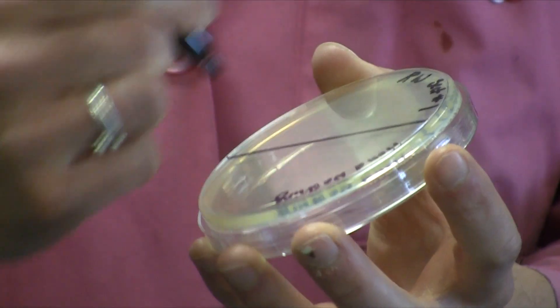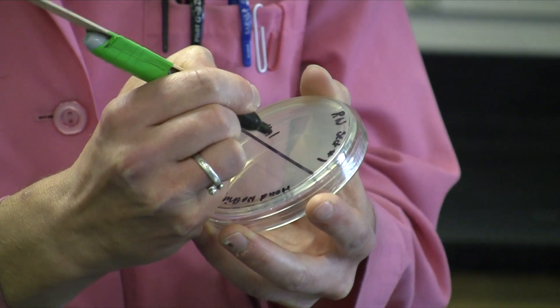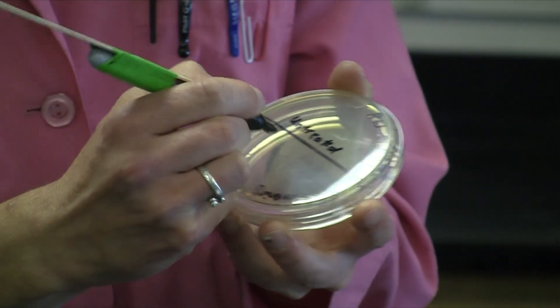From there, label each side — label one side your untreated side, and then label the other side treated.